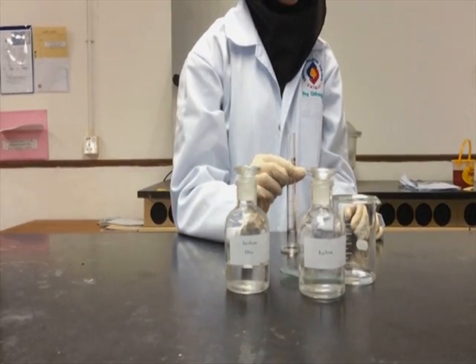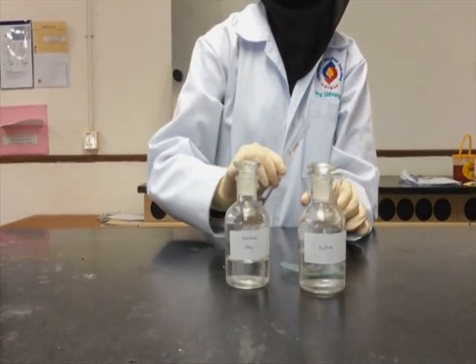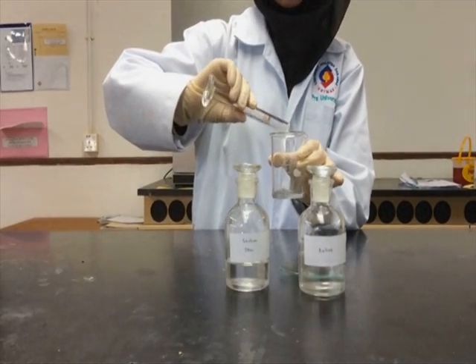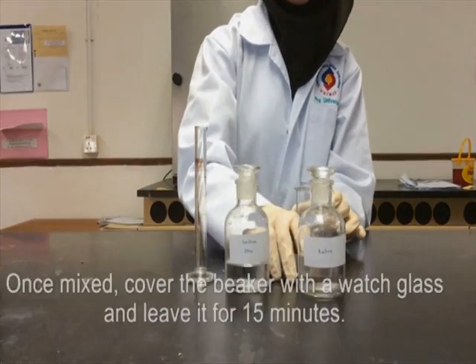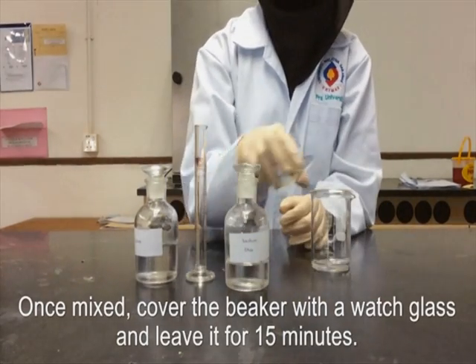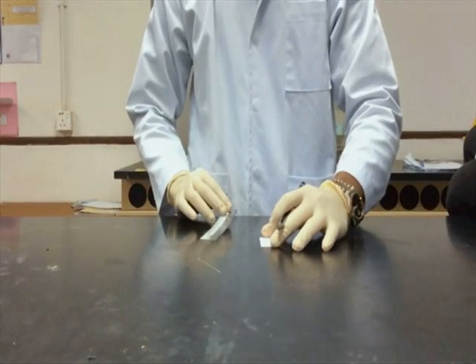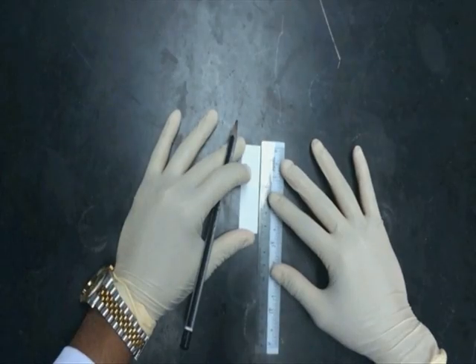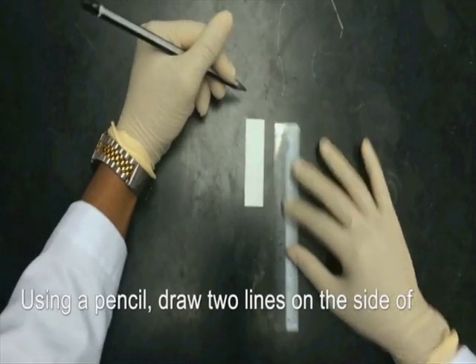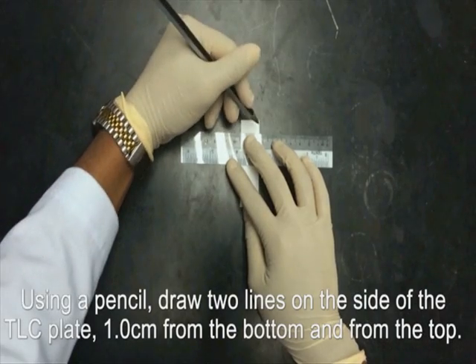Using a pencil, draw two lines on the silica side of the TLC plate, 1 cm from the bottom and another one from the top of the plate.